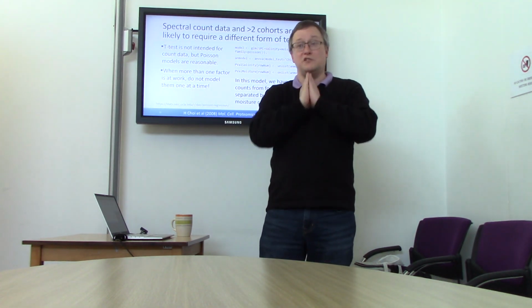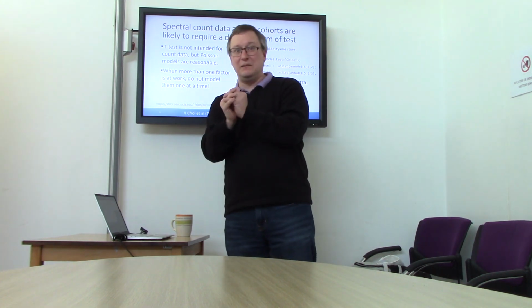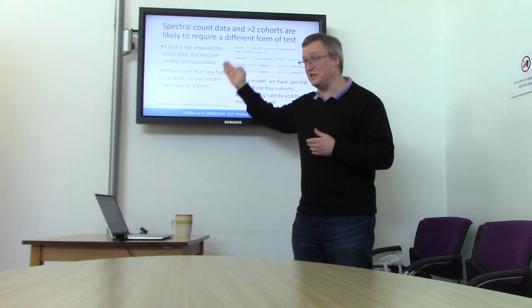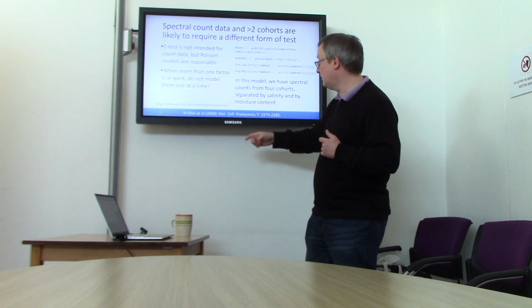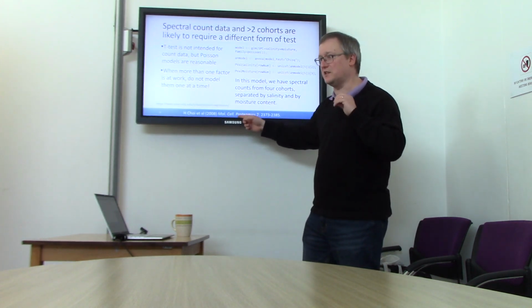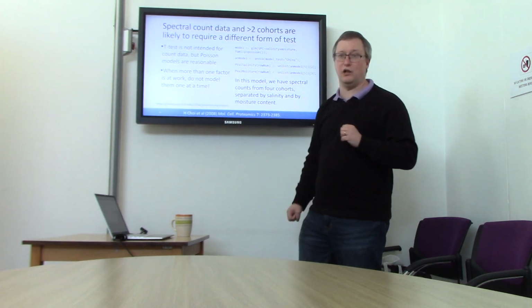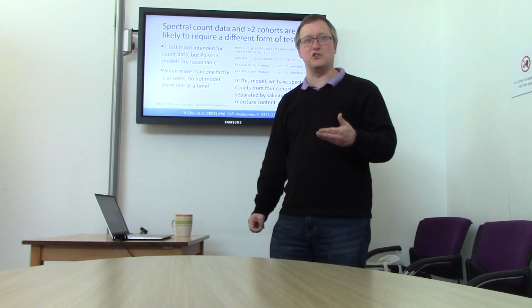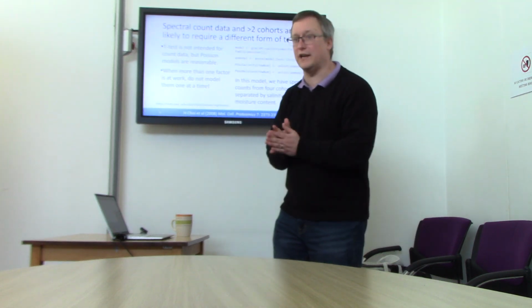Okay, so in many cases, dealing with count data becomes rather more problematic because they are not continuously distributed. You can learn about Poisson regression from this little blue link at the left. And you can see a fine example in the case of spectral count data from affinity purification experiments by Choi et al. back in 2008. It's another case where they used Poisson modeling to analyze spectral count data.